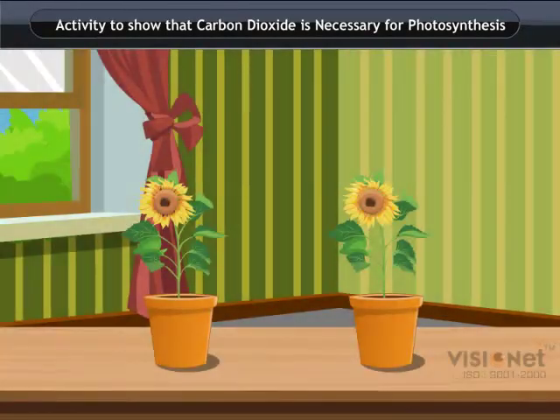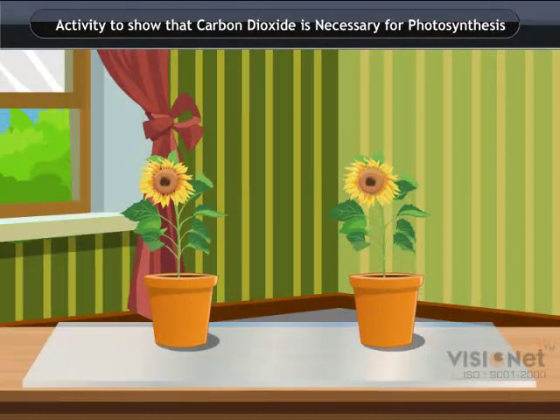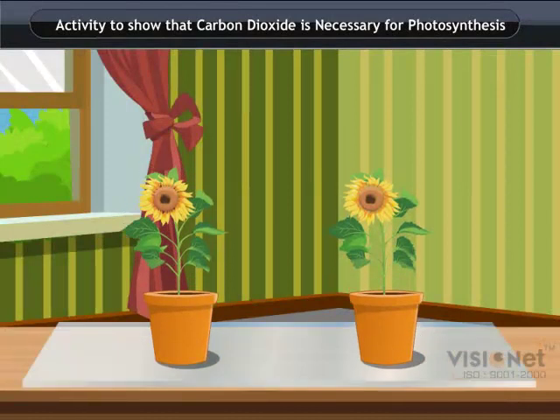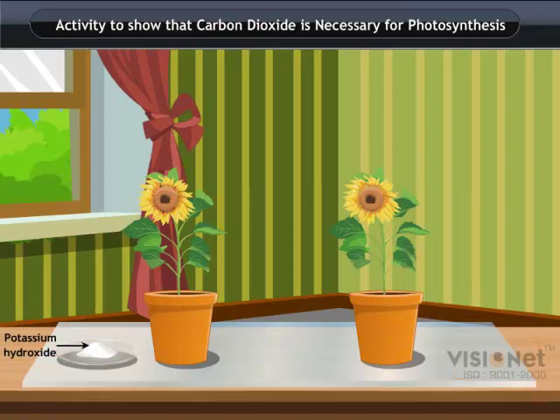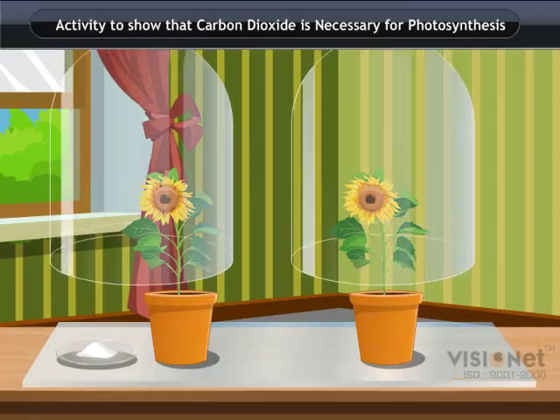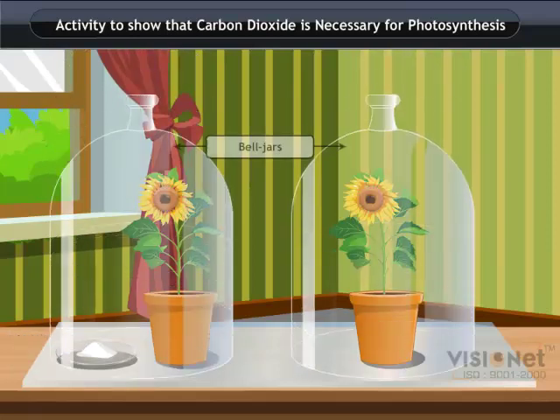Now place each plant on separate glass plates. Place a watch glass containing potassium hydroxide by the side of one of the plants. The potassium hydroxide is used to absorb the carbon dioxide. Cover both of the plants with separate bell jars as shown.